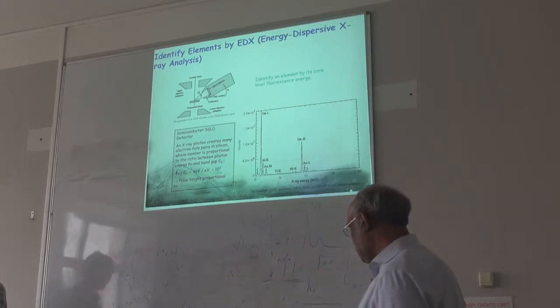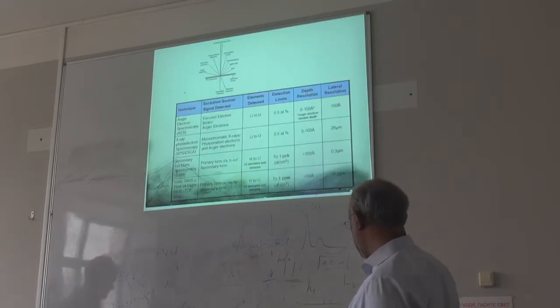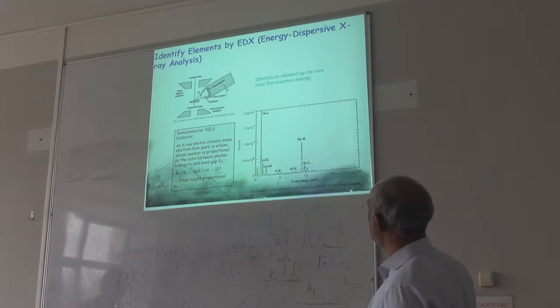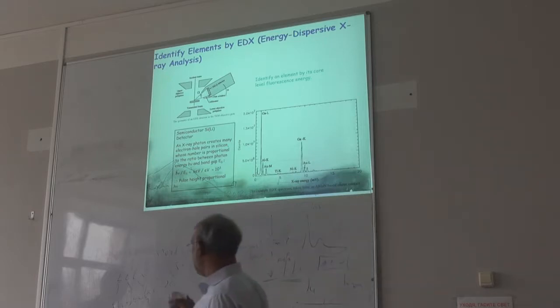spectrum. From that, we know the corresponding energy. From that, you can easily tell whether this is aluminum or gallium or titanium, nickel. Every element you can easily see from this. This is a very easy technique. Sometimes we call it the elemental mapping technique.